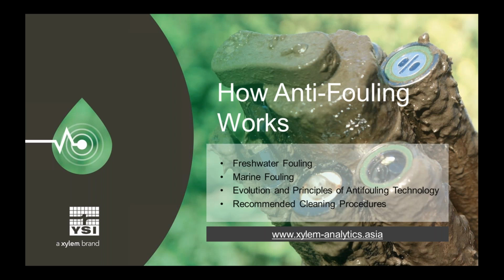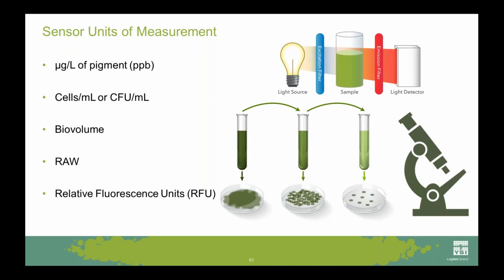Now, it may surprise you that I'm saying this is more important than calibration. Maybe the next thing I talk about will tell you why I feel that way. So the other thing that I consider best practice is to use the right units of measurement. So listed here are units that are options on a number of sensor technologies, including at YSI.